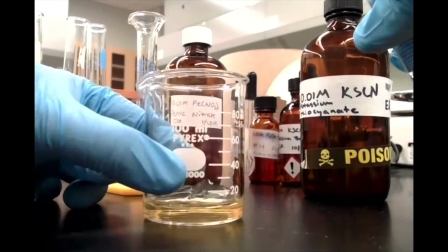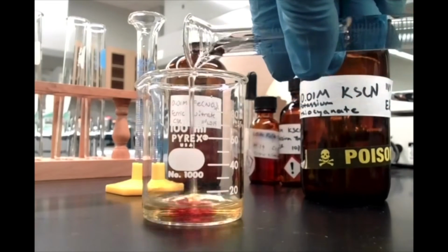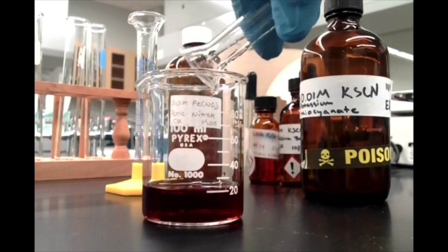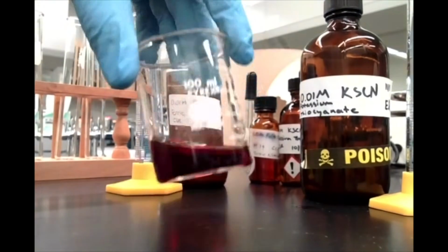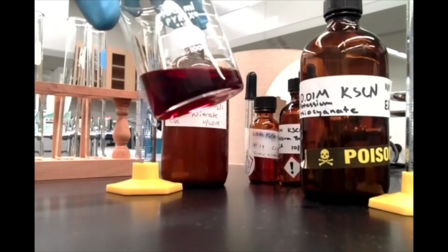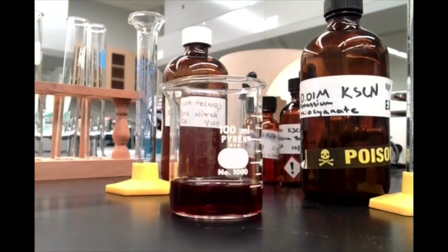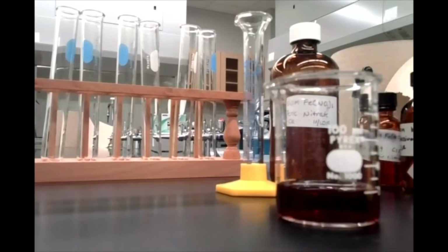Now, if you observe, when I add one to the other, notice that rich red color that we observe. We have this nice deep red solution, kind of a blood red, or like a wine red, I guess. That's the iron thiocyanate complex that we make. So that's what we're going to add to each of our 6 test tubes, and we'll go from there.